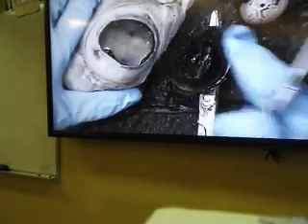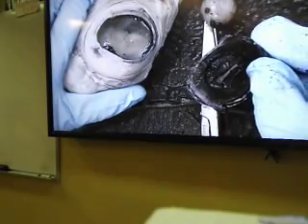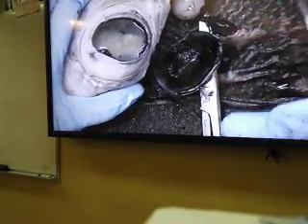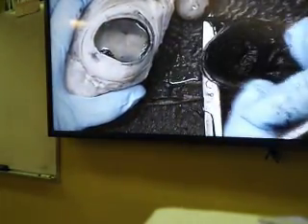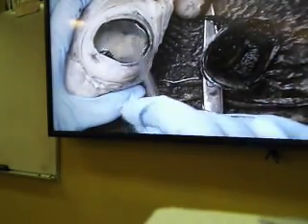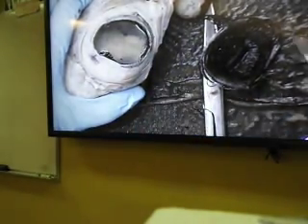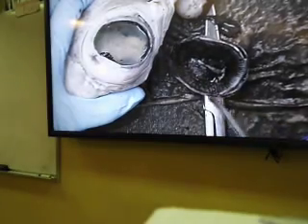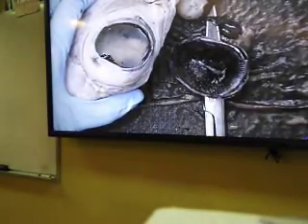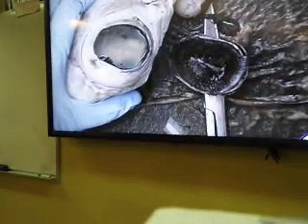So choroid has a lot of blood vessels which supply nutrients to the cornea as well as to the lens, which are avascular, but it also has a high amount of melanin so that it can absorb light as light comes in rather than reflecting light, making the inside of the eye dark. Now choroid, remember, is also black. We will see right now. So the middle layer has all these structures: choroid in the posterior cavity, which we haven't seen yet, ciliary body in the anterior cavity, iris in the anterior cavity, all are black. And that way sometimes it may be easier for you to remember that these are all part of the middle layer.